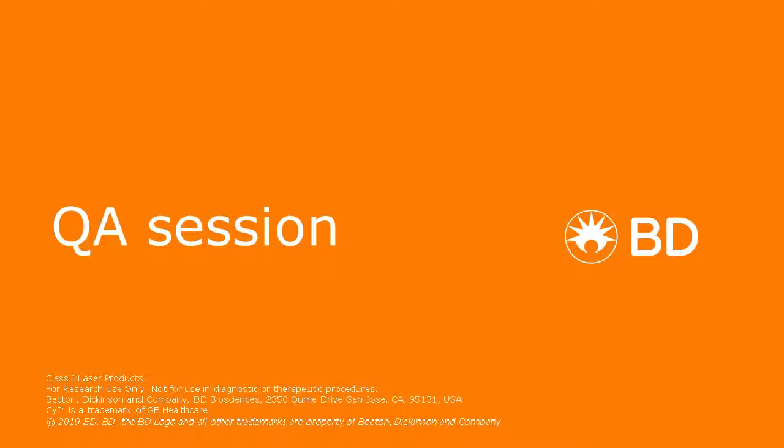Thank you, Dr. Corselli. So our first question is, how do we know if the panel tested provides the necessary resolution? Yes, thank you for the question. There are a number of ways that we can address this question, and I think it all comes down to the controls that we need to include in our panel design.